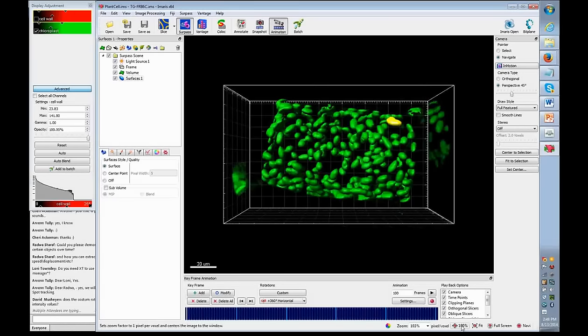You can also click this recenter button, and it will shift even closer to wherever the local maximum is in 3 dimensions. You can also allow the detection to fail for a small number of time points as an object moves along and still get an accurate result because there's something called gap closing.